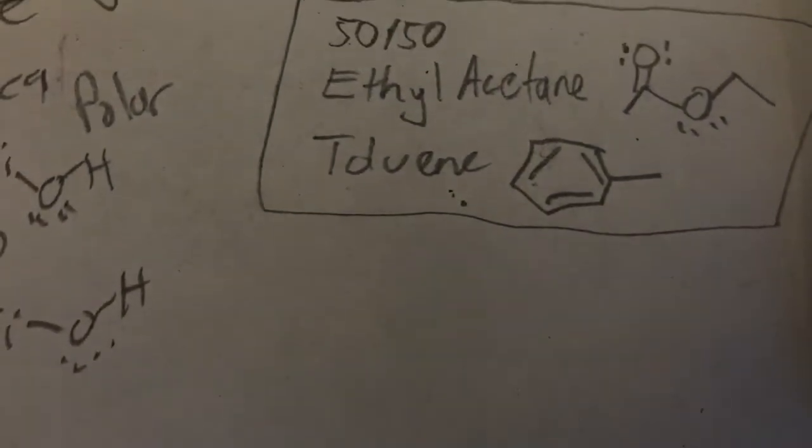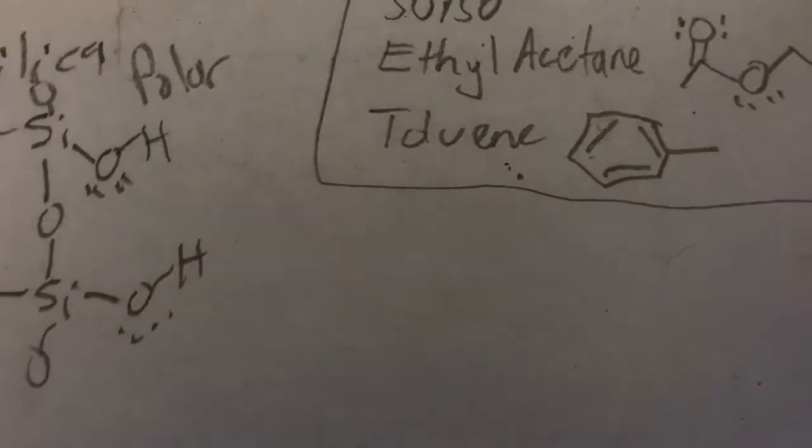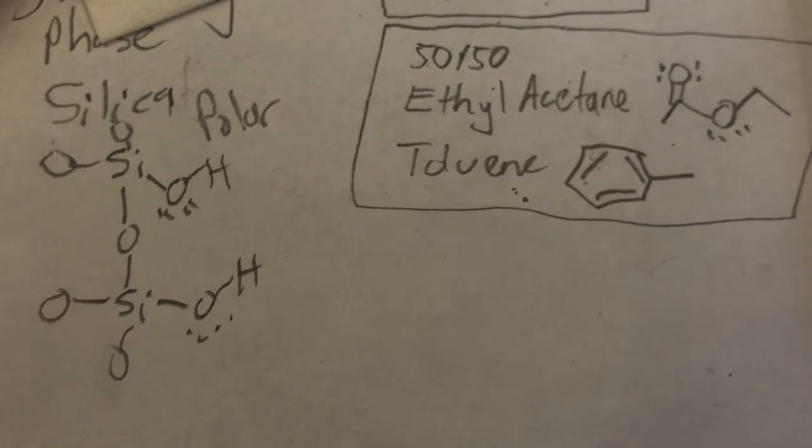Putting on the short wavelength, and look at that, the whole thing looks just pink, but you can kind of see some spots. What's going on? This is something you should know about: one of our solvents, toluene, has not evaporated enough. Not only that, but toluene has conjugation. And so it's basically an organic molecule that's coated the whole surface. Toluene is organic and conjugated, so it's making the whole slide that has toluene still on it pink, so you can't really see your spots.